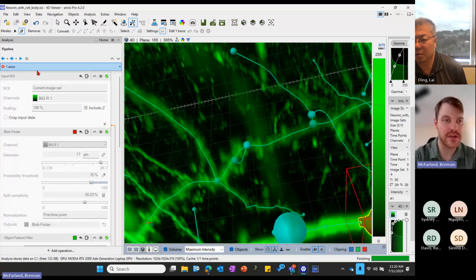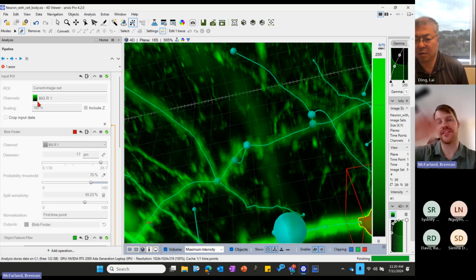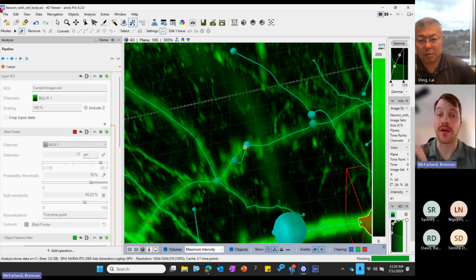So what we can do is some pre-processing. If this automatic tracer doesn't work, or maybe there are a lot of cases where you have really low intensity regions, then it picks back up again, instead of having to manually correct it all, which you could do, you can try some pre-processing and see if that helps the automatic tracer first.